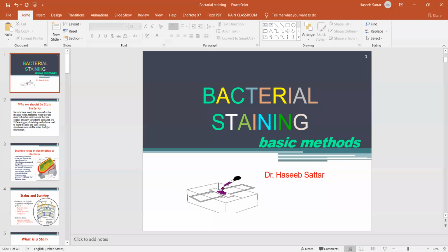We will discuss how we stain, how we color the bacteria, and what the different methods, techniques, dyes or coloring agents are which we use to identify or stain the bacteria first. This staining will be helpful for the identification of bacteria and the type of bacteria. Not only clinically, in microbiology these staining techniques are the backbone of microbiology.